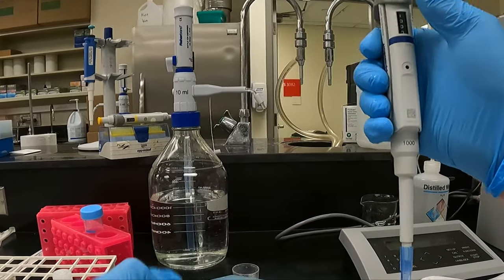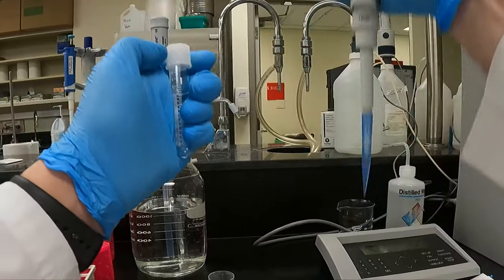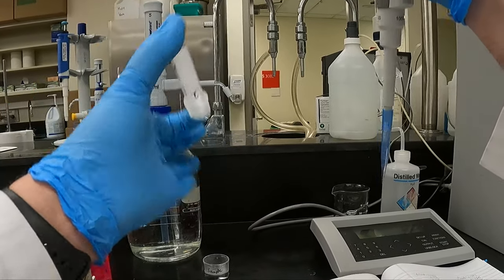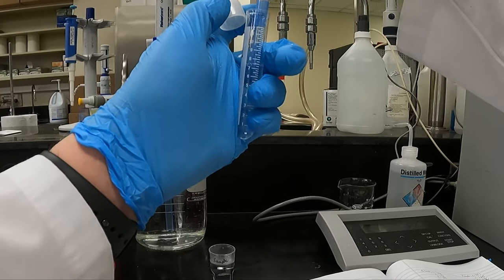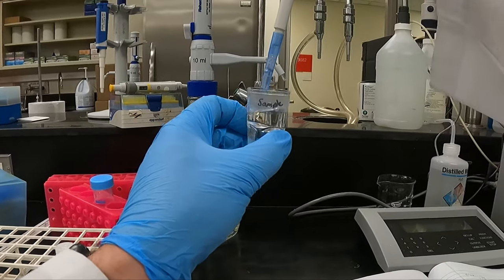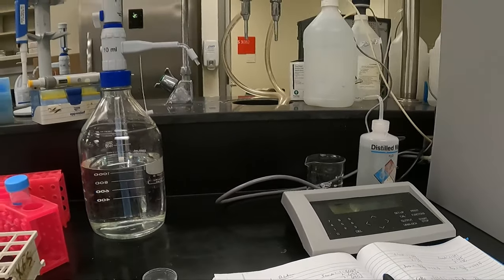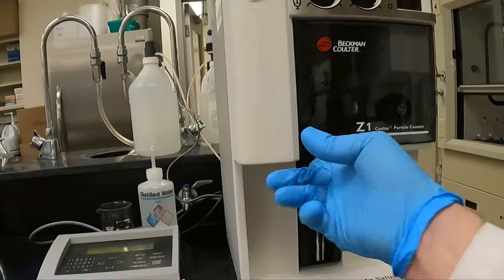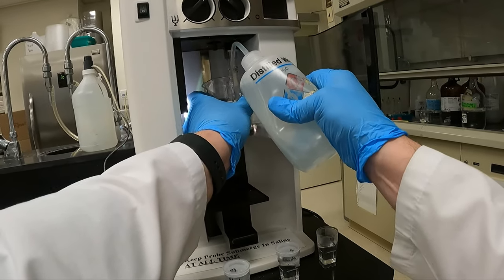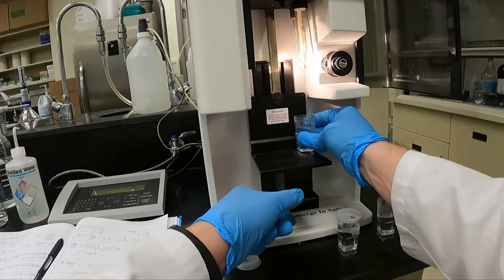Again, it's quite a dilute solution, so instead of loading in 0.2 mils, I'm going to load in 1 mil. Make sure you mix it before you sample. So by adding in 1 mil, my dilution factor will be 21. Clean the probe. Run the blank 3 times.